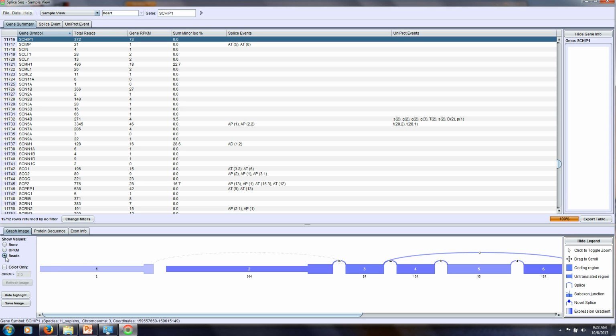And so if we look at this, we saw 364 because this is such a long exon. We had 95 on the neighboring shorter exon. Once we've corrected that for the length, we get values that are at least kind of in the same ballpark and allow us to compare across exons. Okay, so here we see this promoter, exon 2, being used in heart tissue much stronger than the promoter 1. We had almost no reads on this promoter, or this first exon.